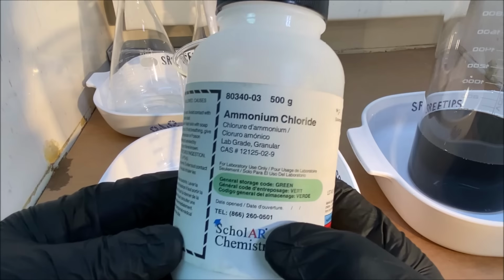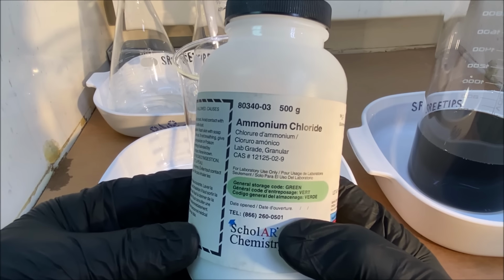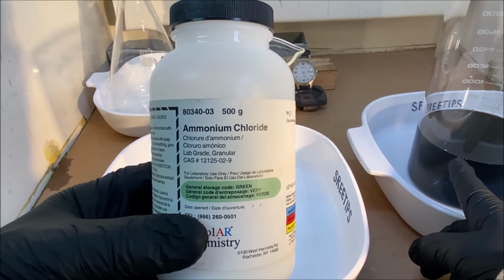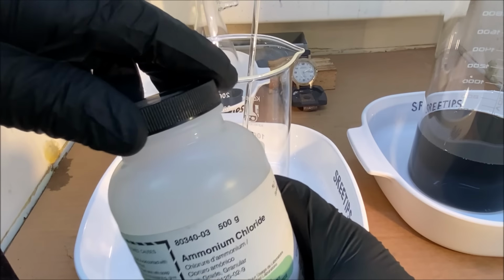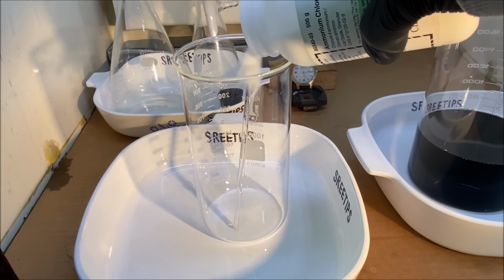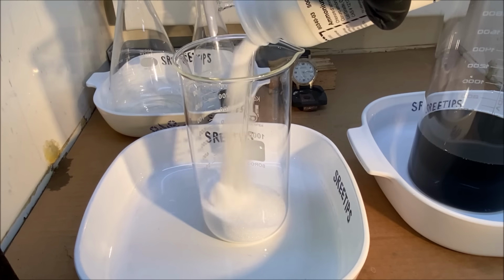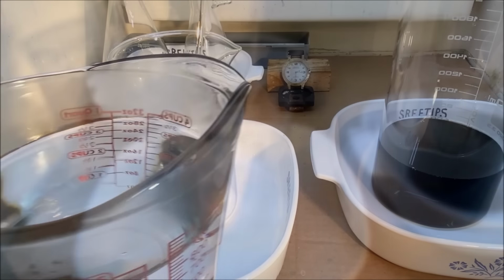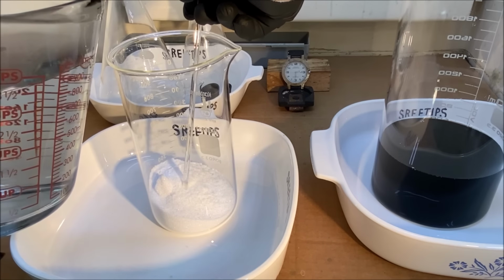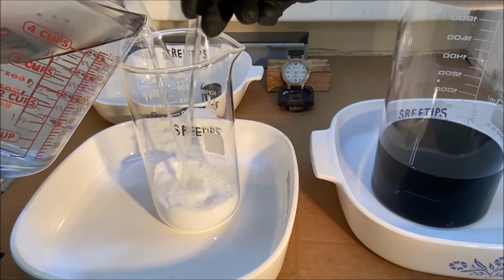I've got some ammonium chloride here, and what we're going to do is use ammonium chloride to precipitate out our platinum. I have no idea how much to use, so I'm just going to put in about a couple hundred milliliters worth. I've got some warm distilled water here. We're going to dissolve this ammonium chloride in some warm distilled water.